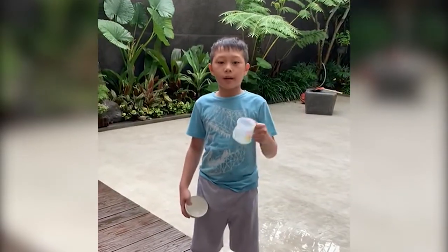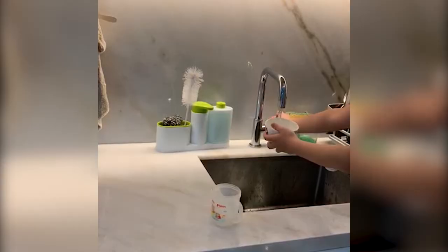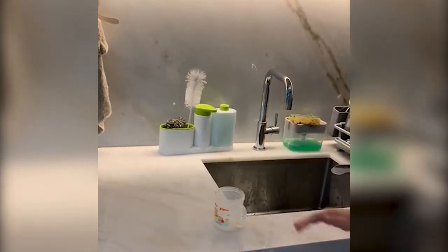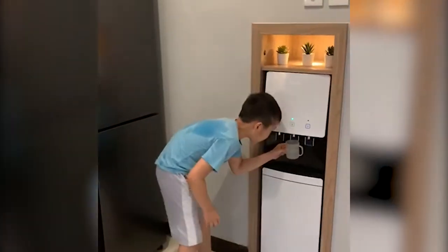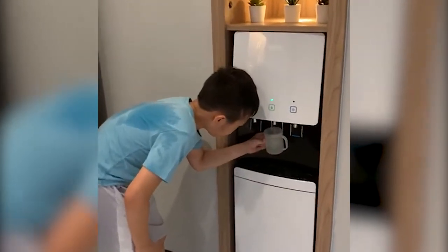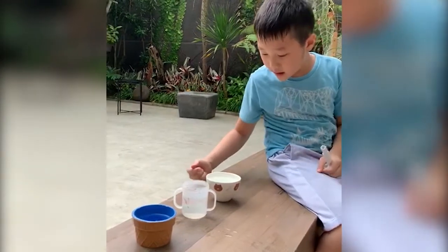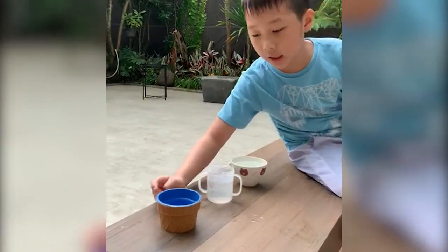Now let's compare the tap water and the drinking water. Now let's do the other drinking water. This is the tap water, the drinking water, and the ring water.